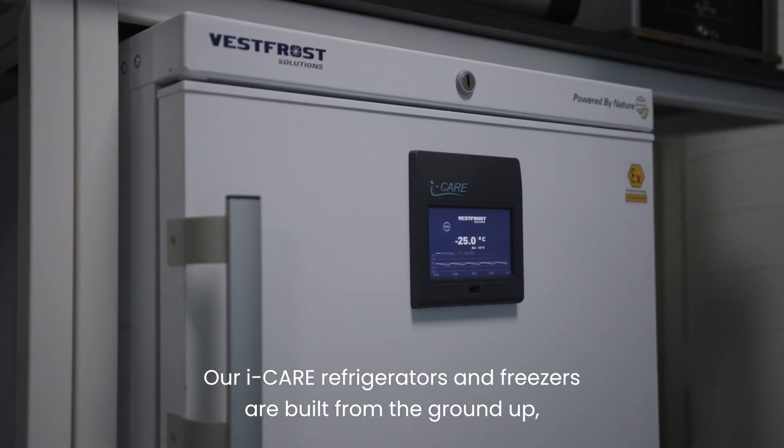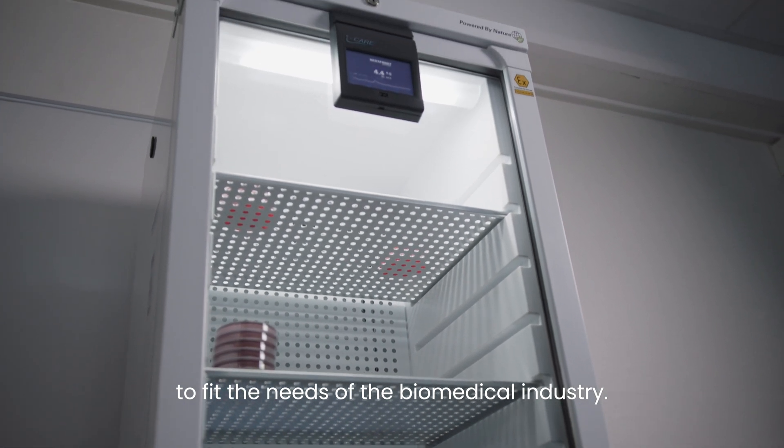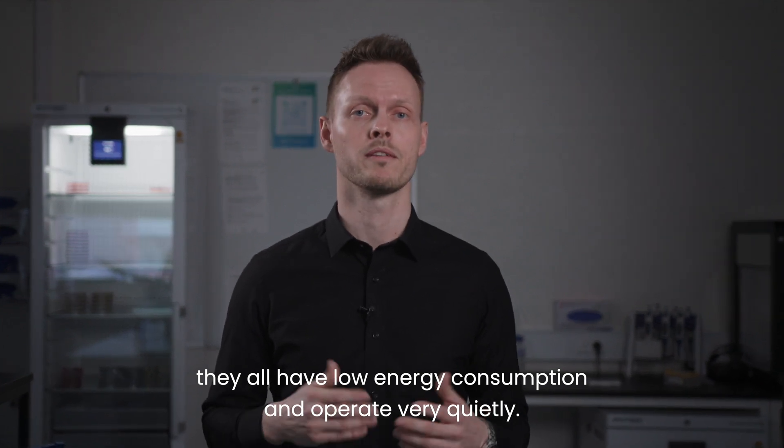Our iCare refrigerators and freezers are built from the ground up to fit the needs of the biomedical industry. With adaptive cooling technology, they all have low energy consumption and operate very quietly.